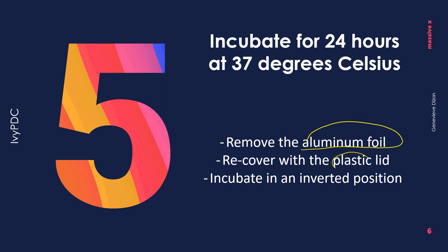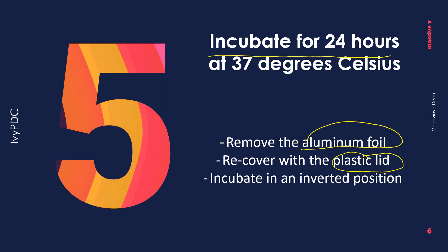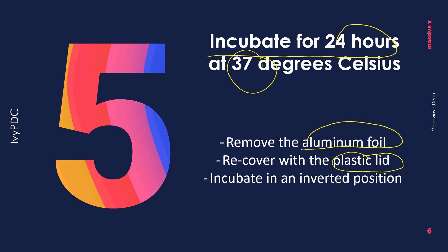After two hours of exposure under the UV light, remove the aluminum foil and replace the plastic lid of the petri dish. After that, we can now incubate for 24 hours at 37 degrees Celsius.